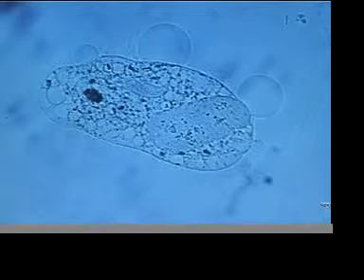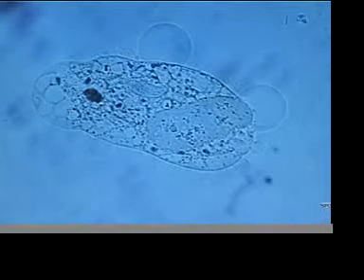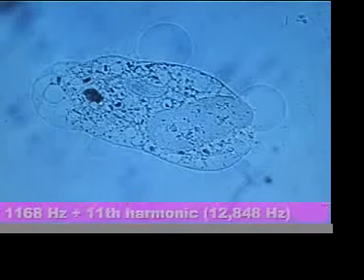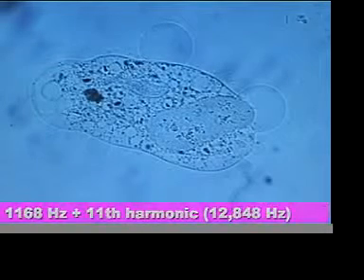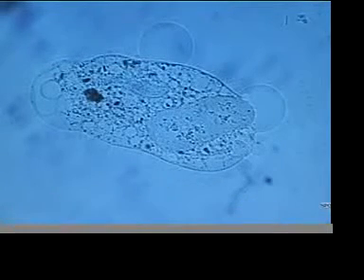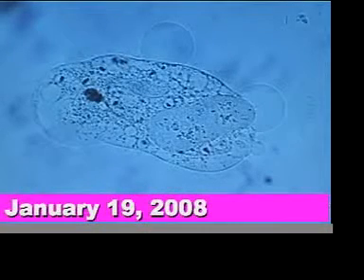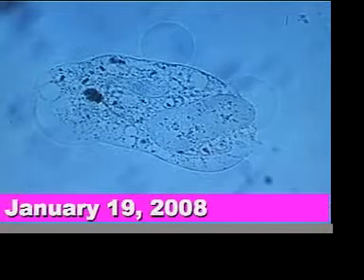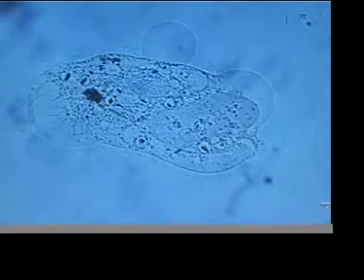This was a paramecium. This frequency is 1168 hertz plus the 11th harmonic, 12,848. Today is January 19th, 2008. This is about 110 watts, SWR 1.18. This is a Rife-Bare plasma experiment, and the plasma device is about 6 inches away from the microscope slide.